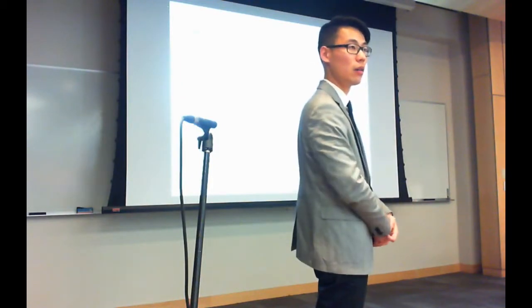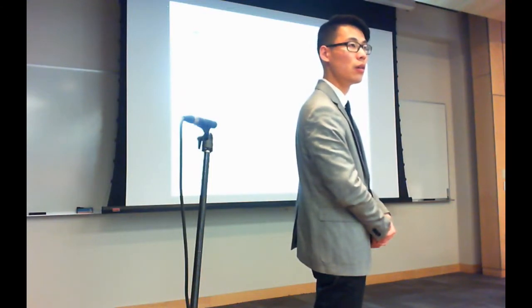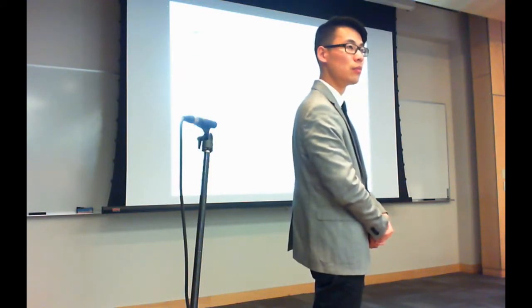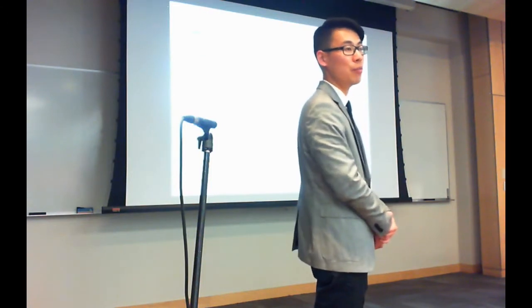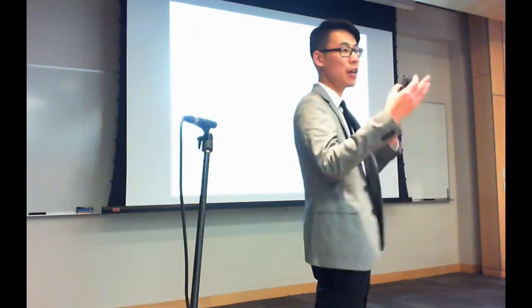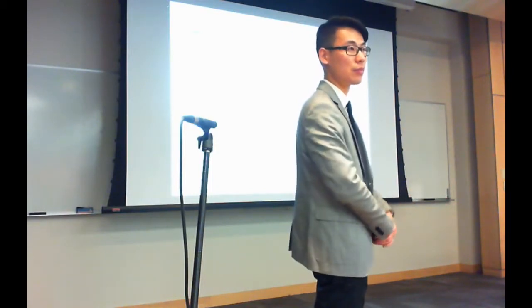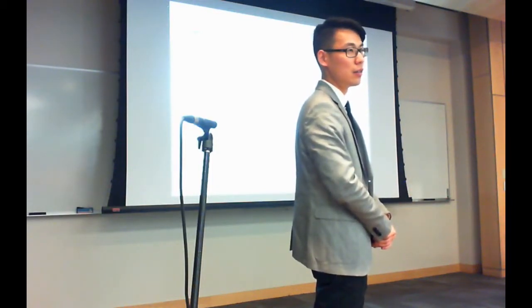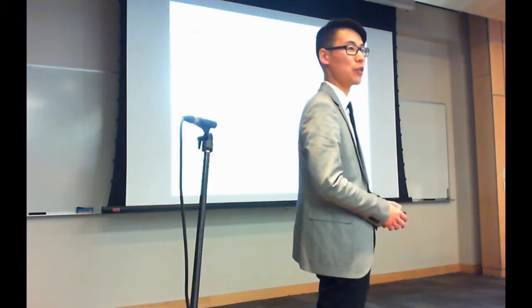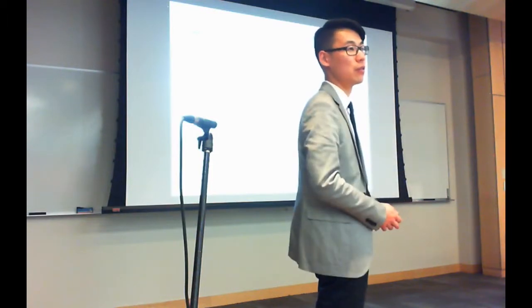And then maybe a very practical question. For me as a proteomics user, do you think it would be time to switch from a database search to spectral libraries? For example, if I study something very well studied like the human proteome. It depends what you're looking for. If you just want to count proteins, definitely go to spectral libraries. If you want to find something new with a new modification, libraries aren't going to help you there. Okay, so you can't do spectral proximity search the same way we do with natural products? We can, but you will see we had to think about the error rates in those cases. We actually worked on that a couple years ago. You lose a lot of sensitivity, but it might work out for you.